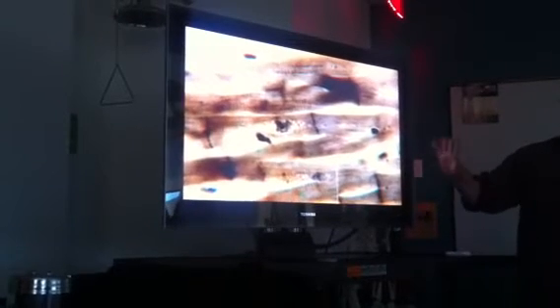Now, in your slides, you may have seen the intercalated discs as white, right? If you notice that? Yeah. Some of the slides are like that. They're white. Some of them are like two black lines with a little white in the middle. That just comes from the staining technique. But this one here has really nice black stained intercalated discs. We'll talk a little bit about those when we talk about muscle physiology at the end of this course.